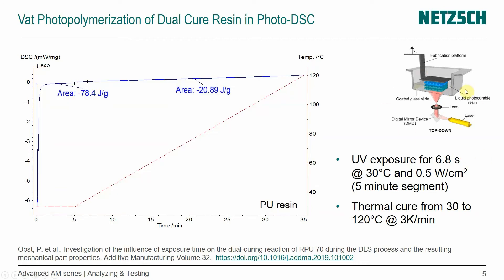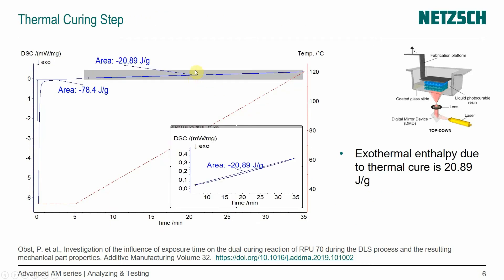And it's that top-down process that we have talked about. What do we see? The exothermal reaction is facing downward, so as the material is exposed to UV light, we see a first exothermal reaction that gives us an area under the peak, and then we have the thermal cure following. We can also see that there's a deviation from the baseline, and when we zoom into that area, you can really see the deviation, and the area under that curve is 20.89 J per gram.